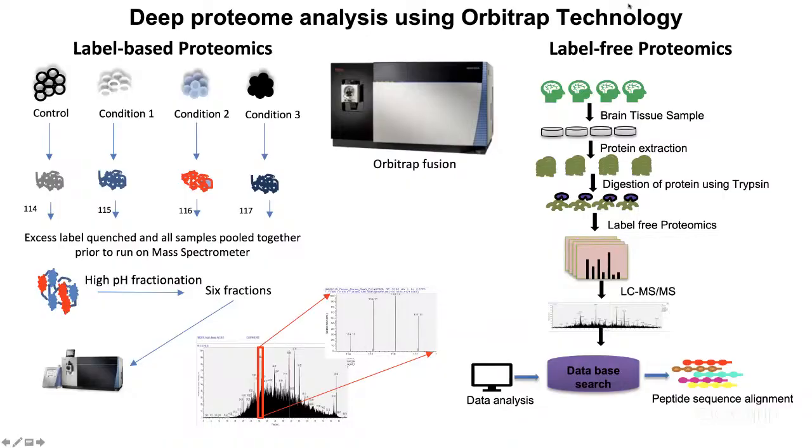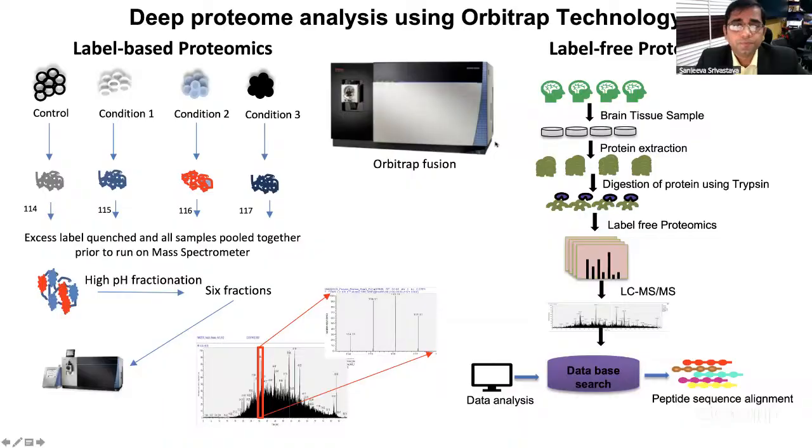So TS will now take the peptide and will go shortly to one of the instruments which we have, which is a high throughput proteomics instrument for doing the deep proteome analysis. Most of the time, your goal is first to look at in total how many proteins we can get from that sample, right? So in that way, you are now going to do the deep proteome analysis, and there could be different workflows, as we talk, DDA, DIA.